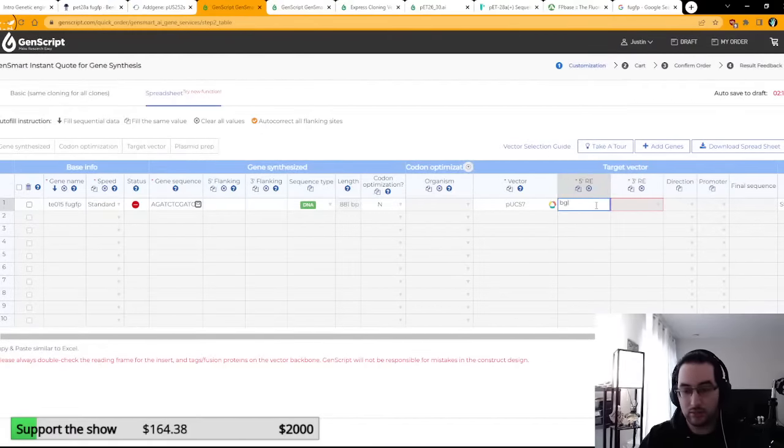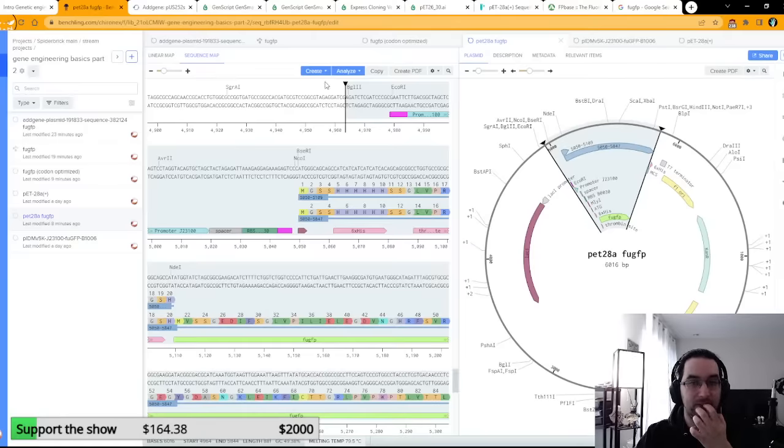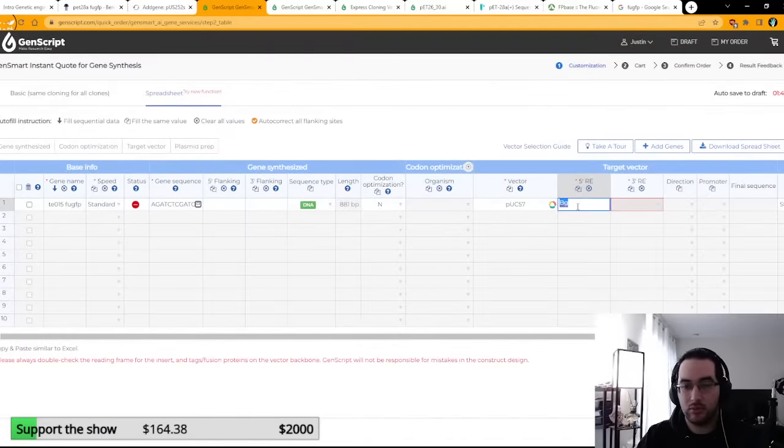So BGLII. And that should come up, but it's not. I don't know. Why is it not coming up? BGL. What? Do they not have BglII? Oh, that's unfortunate. That's really annoying. SgrAI, let's see if they've got that one. SGR. No, they don't. Why do they not have BglII? Wow, that's really frustrating. Okay, well, they don't have BglII.